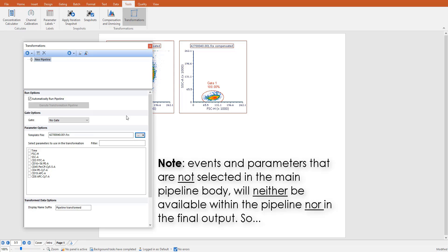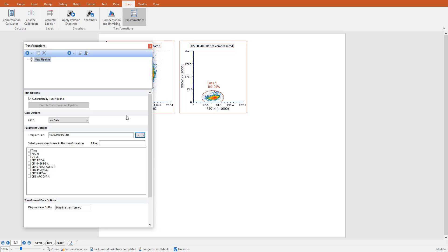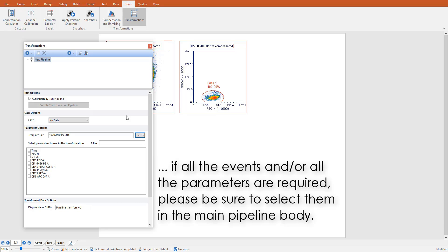It is important to note that the events and the parameters which are not selected as input data in the main pipeline body will neither be available in the subsequent steps nor in the final output. So if all the events and/or all the parameters are of interest, either within the pipeline or in the final output, please be sure to select all events and/or all the parameters in the main pipeline body.